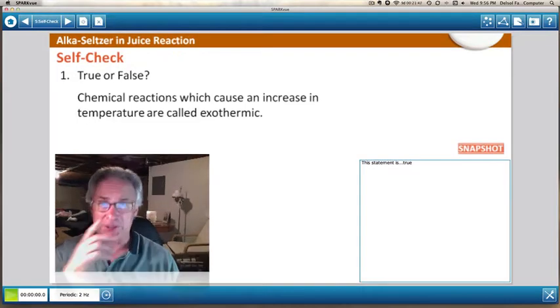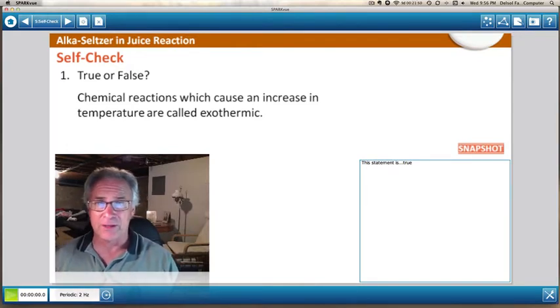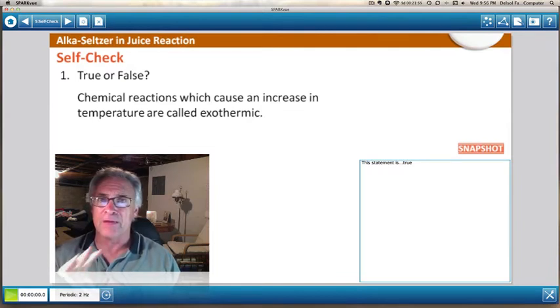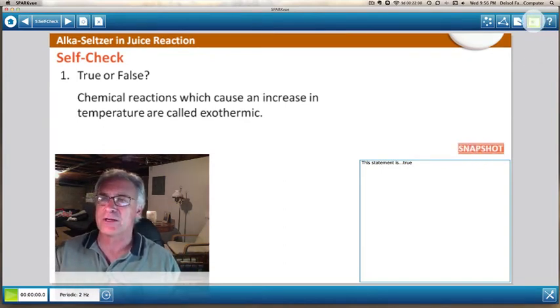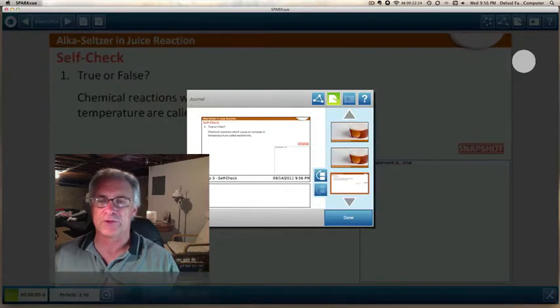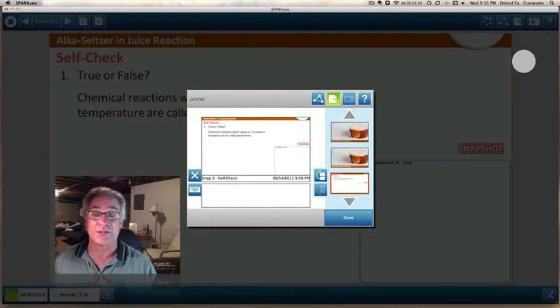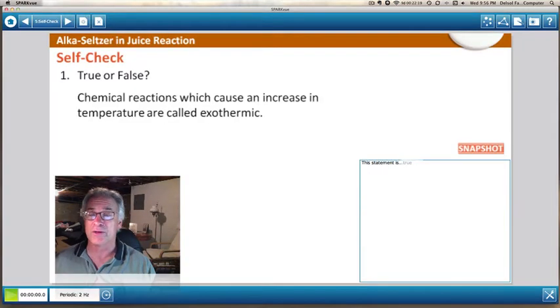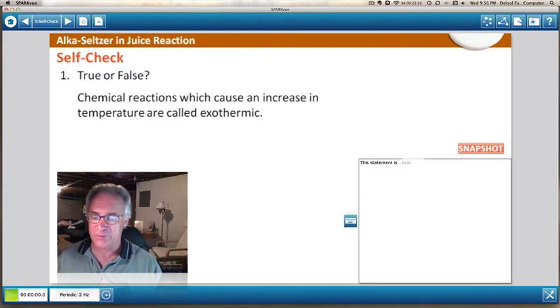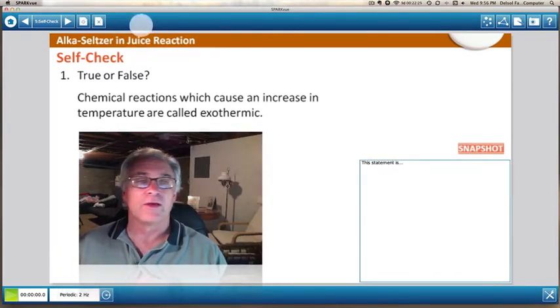Click OK. And you have touchscreens on all of your data loggers. So you don't have to have a keyboard. It really is a very good touch screen. But sometimes you're going to have to maybe go click it again. So make sure that you keep up with the piece of equipment that you have. So you're going to take a snapshot of that. So you click on the camera. And you can see it says true. So I'm done there. I know the picture's been taken.